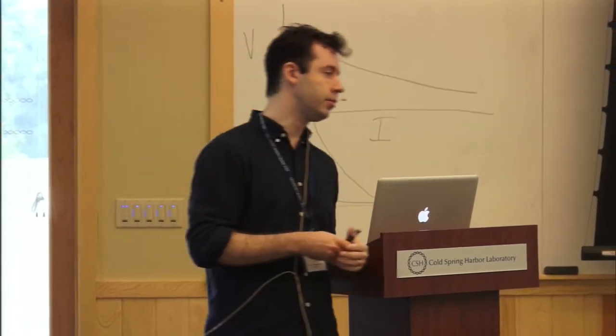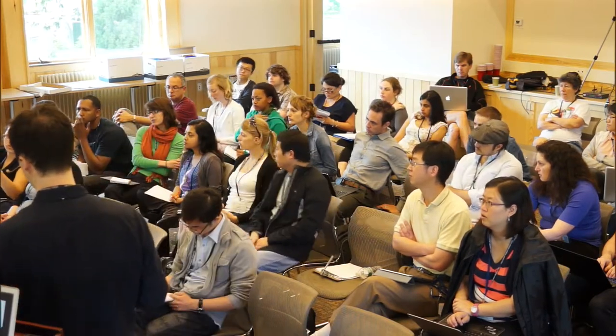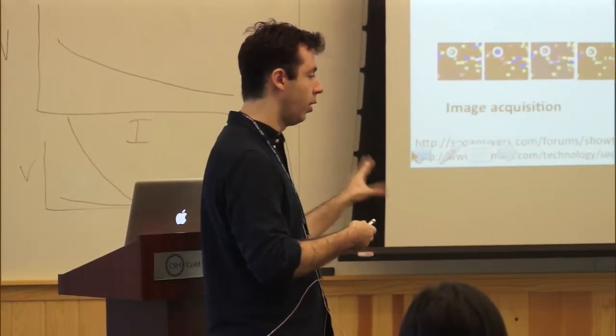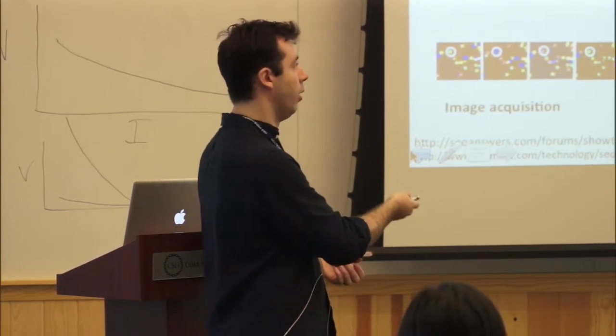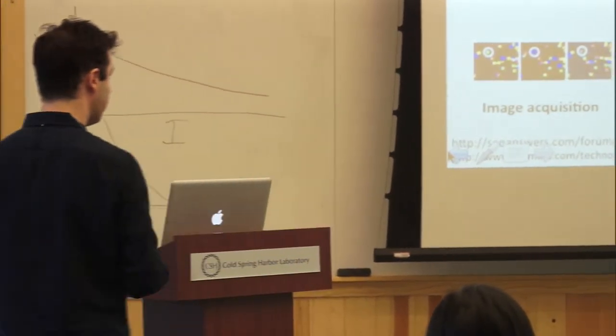Yeah. Do you do the sequencing once the cluster grows to a certain size, or it seems like here you're doing it as you're having nucleotide. The sequencing is done. So you have cluster growth. That's one step. And then you don't go back to it. You, in fact, don't even do the cluster growth on the Illumina machine. You do it on a separate machine. But the sequencing itself is happening after all of the clusters are grown.